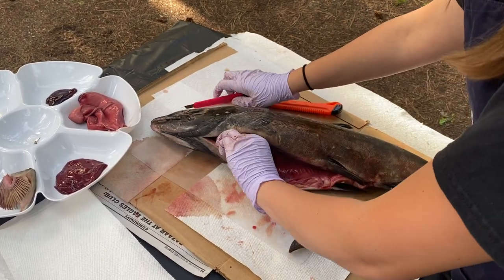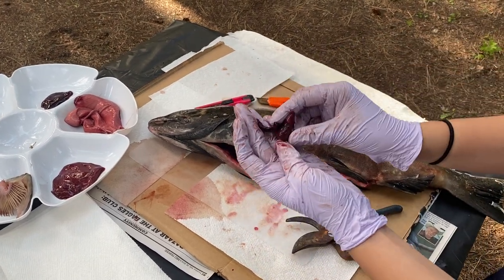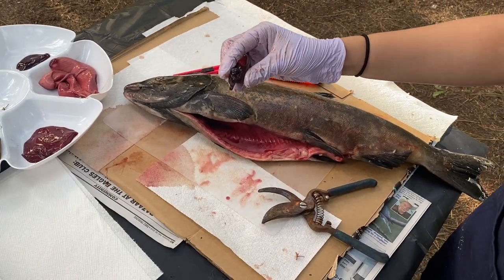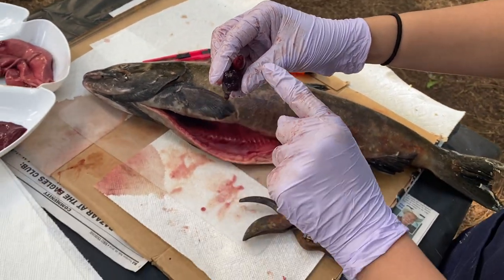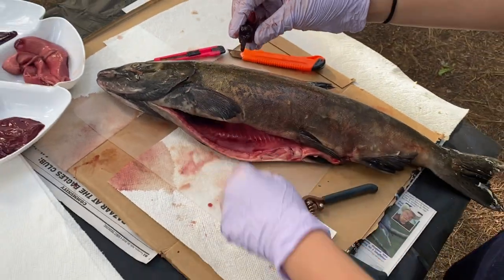And the heart function is super similar to the function of human hearts too. These guys have a 2-chamber heart. Humans have a 4-chamber heart. The heart is what is going to pump the blood throughout the whole body of the salmon and get those nutrients in. If I squeeze it, you can see that that is the valve, and that is where the blood would pump from and go all throughout the body of the salmon.